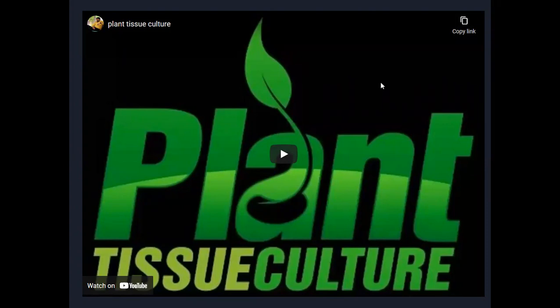Every cell of a plant is similar to a zygote-like structure. The zygote develops into a complete plant under normal conditions, but plant cells are similar to the zygote condition. They also produce a complete plant on the nutrient medium.